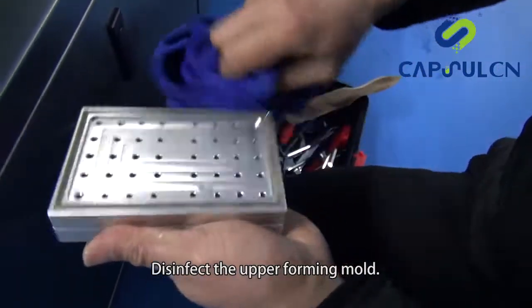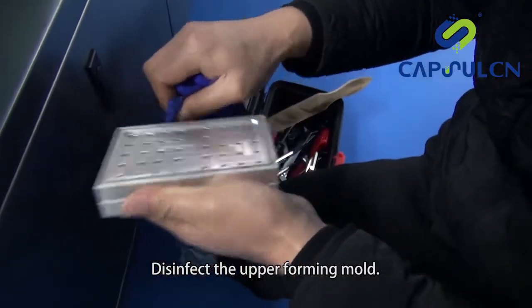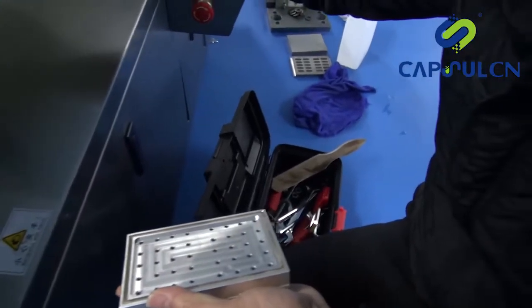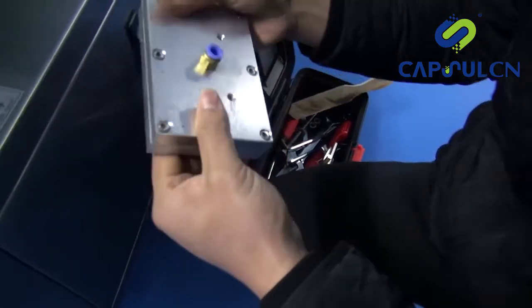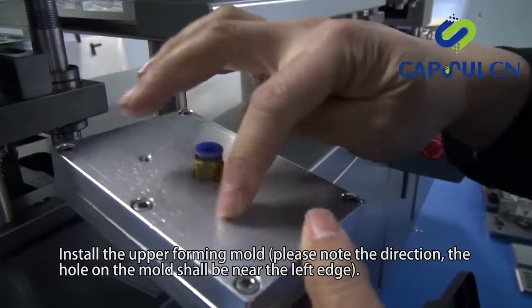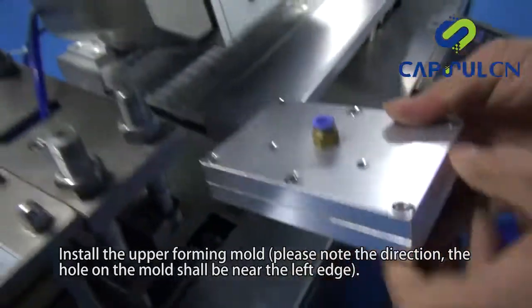Disinfect the upper forming mold. Install the upper forming mold. Please note the direction — the hole on the mold shall be near the left edge.